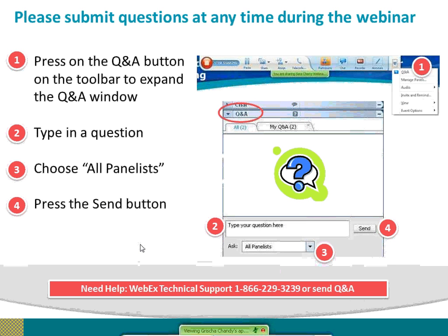I have a couple of questions for Julian. One is, you talked about DNA average intensity and mitosis-specific staining as readouts for the cell cycle. Are these two different outputs interchangeable, or is there one readout that you prefer? Well, in some cases they can be interchangeable, but our preferred readout is mitotic-specific staining, especially for difficult cell cultures where nuclei are not easily distinguishable and segmentation is not 100% correct. So mitotic-specific staining always worked better for us. We're now developing a CME module, which would allow us to work with those difficult cells, clearly separate the nuclei and count them. And then we use mitotic-specific staining to count nuclei arrested in mitosis.